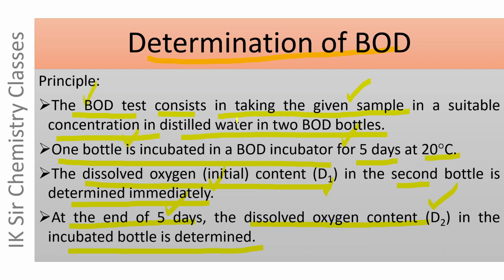The water sample in suitable concentration is taken in 2 BOD bottles.